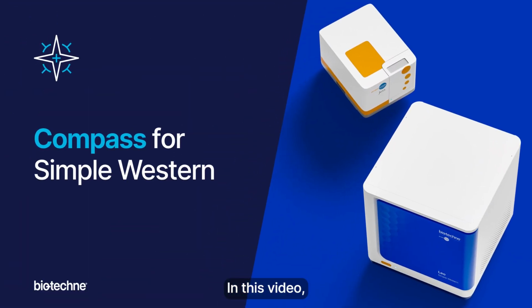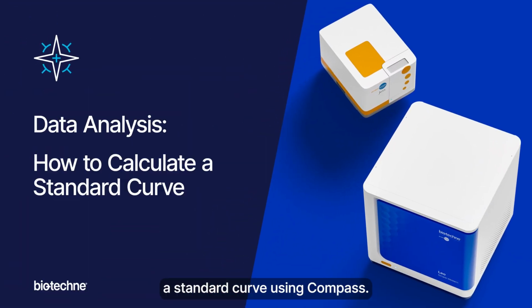In this video, we will learn how to calculate a standard curve using Compass. Make sure you have fully annotated your assay template with sample names and attributes. This information will enable Compass to quickly calculate a curve. Also, if applicable, perform a cartridge correction. See the video on cartridge corrections for more information.